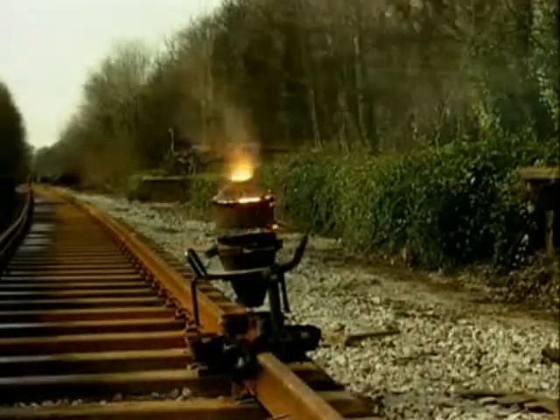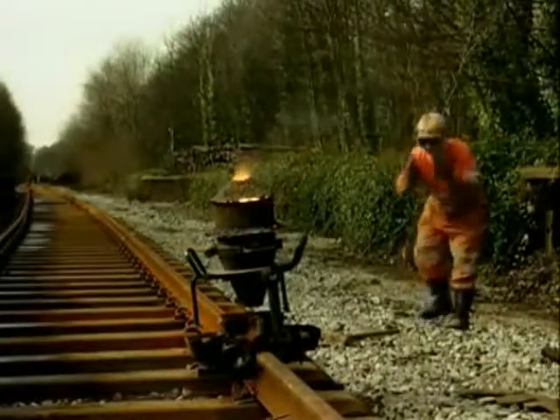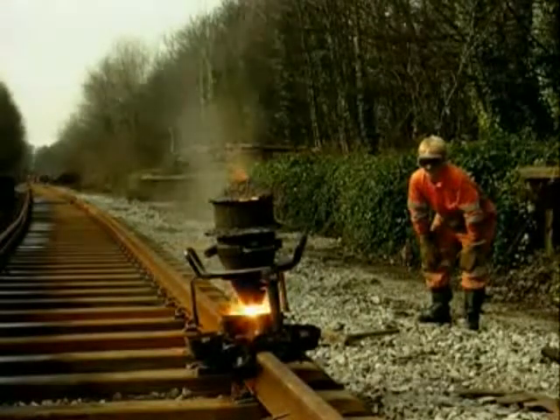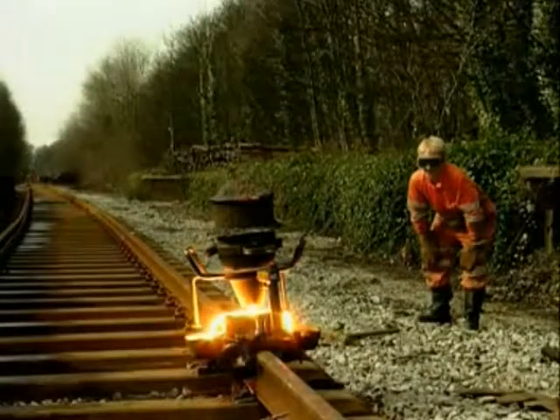This reaction is so effective that it's used on a larger scale for welding iron railway tracks together. Molten iron fills the gap.